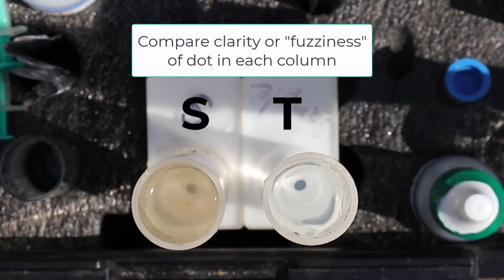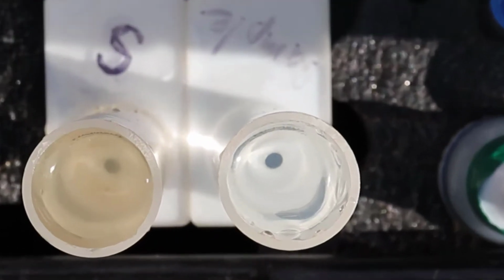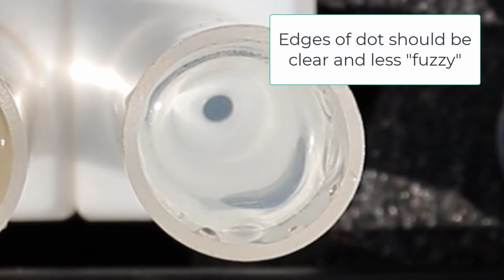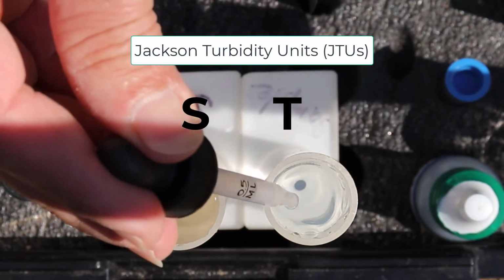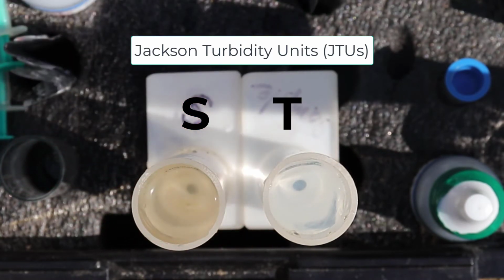For this test, you will be comparing the clarity or the fuzziness of the black dots in the bottom of the two columns. Do not consider the color of the water. Typically, the tap water in the T column will be clearer than the sample water. Therefore, the dot at the bottom of the T column will appear clearer, sharper, with less fuzziness. We will determine the turbidity of our sample water in Jackson turbidity units by counting how many additions of standard turbidity it takes to make the tap water have the same level of turbidity as the sample water.